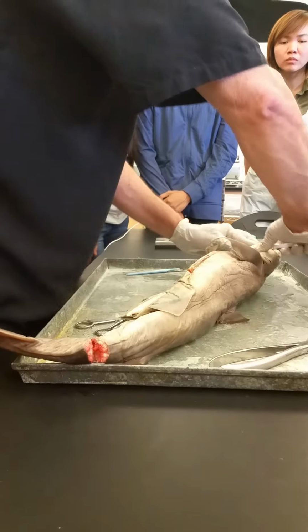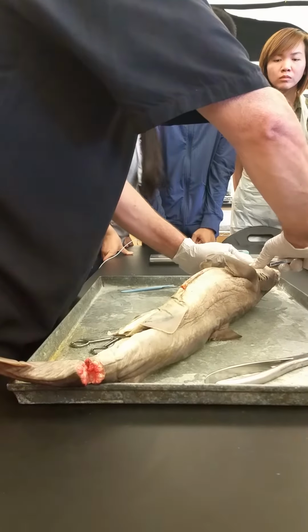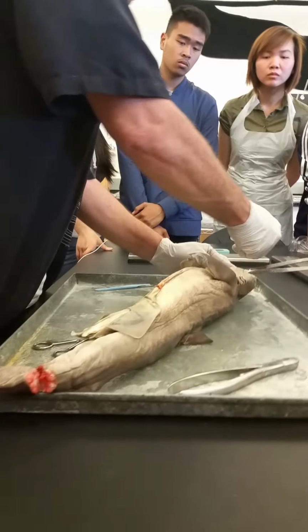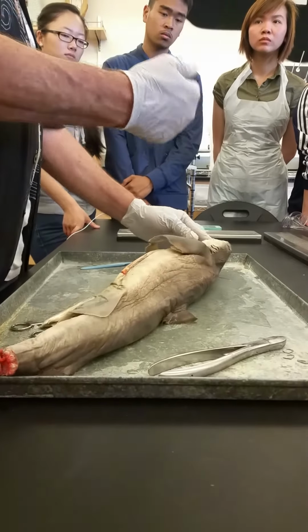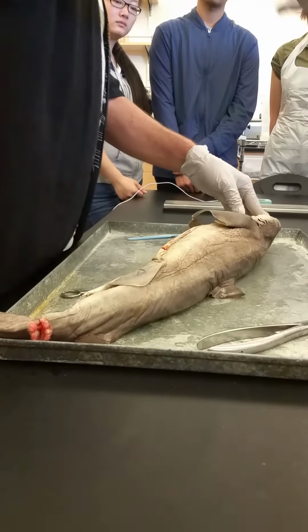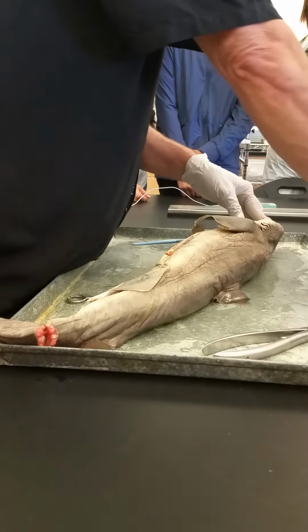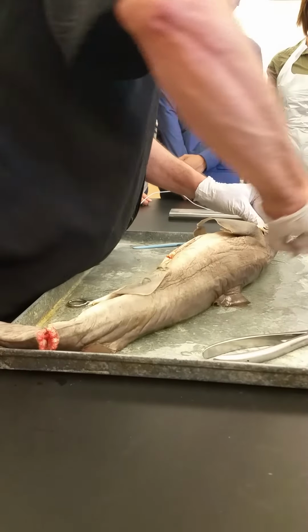And it's just in the skin, in the dermis of their skin. So they're constantly making new teeth, which are then migrating forward, so they always have sharp teeth, and then they shed those teeth. So they're shedding teeth and replacing them with new teeth from behind. So they always have sharp teeth. They never wear them out or get them worn down or anything like that.